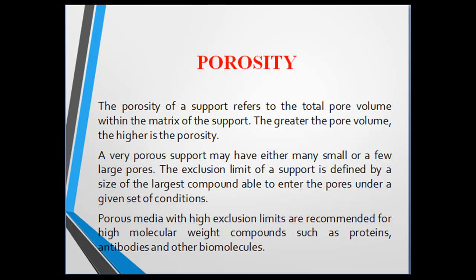Porous materials with high exclusion limits are recommended for high molecular weight compounds such as proteins, antibodies and other biomolecules. Low or high porosity medium with a low exclusion limit is recommended for separation of low molecular weight compounds such as inorganic ions and organic acids.